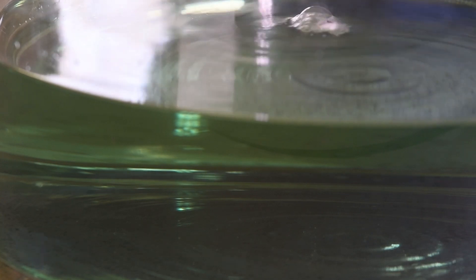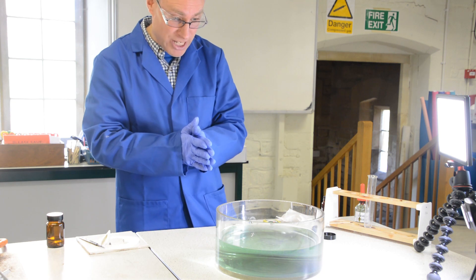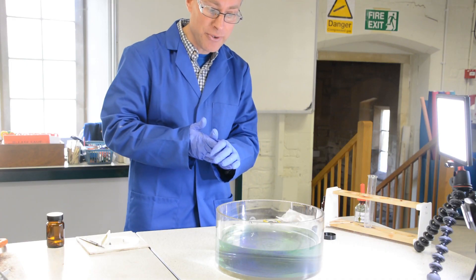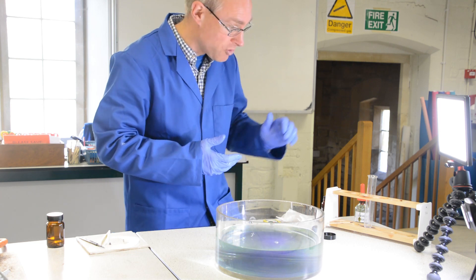I'm going to pop that piece of lithium onto water. The first thing you'll notice is that the lithium is floating on the surface of the water — lithium is less dense than water, which is unusual for a metal. You'll notice it's moving around, it stays as a sort of cubic shape as it floats. It's fizzing, producing a gas, and also producing a bit of smoke. You'll see that the indicator is going purple, which tells us we're producing an alkali — and the alkali in this case is lithium hydroxide.